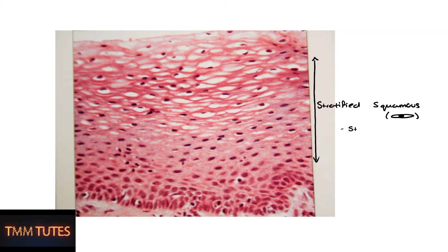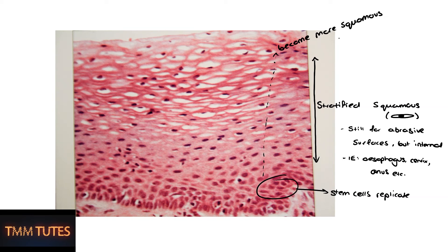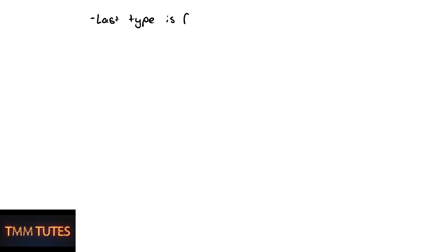Here we have the stratified squamous epithelium mentioned before, but this time it has no keratin — non-keratinized stratified squamous. It has many layers. Notice at the bottom the cells are more circular, and as they extend toward the top they become flatter and more squamous. This is still for abrasive surfaces but found internally — for example the esophagus, cervix, or anus — places that have to deal with rough objects passing through.